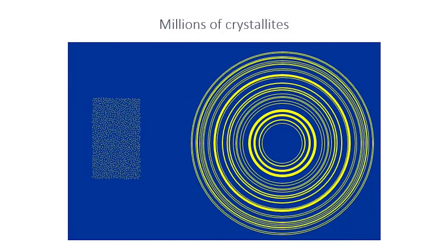And what we do in an X-ray diffraction experiment is we assume that your sample looks something like this on the left, where all different possible orientations are represented in your sample. And so instead of seeing individual discrete spots, you see these rings because that spacing can be seen in all different orientations.